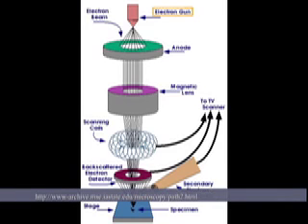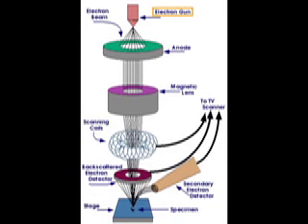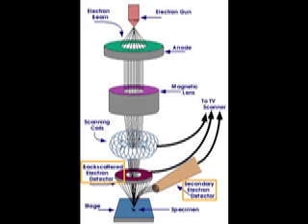Alright, so what are the main parts of a scanning electron microscope? So basically you have the electron gun, the place where the electrons are generated, and you have the different lenses and apertures within the system. The electrons are brought into a beam, and then they're focused to a point on the sample. And then there are coils that scan them back and forth that help you get the images. The other parts are the detectors, which detect the electrons that form the image.